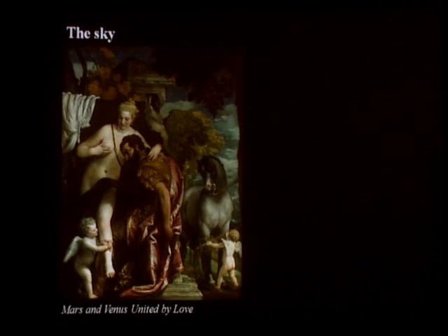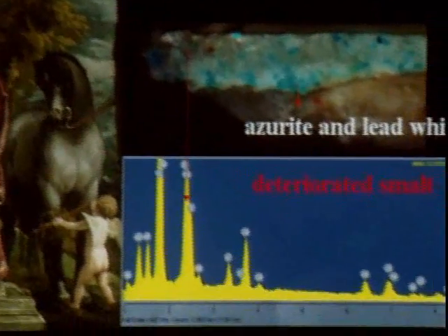Though most pigments in this painting have survived in an almost pristine condition, it had long been debated that the abrupt transition in the sky — from the lower part that looks greenish towards the upper part that looks a deeper blue — was not intended by the artist. Analysis of the pigments has shown that this is in fact true.